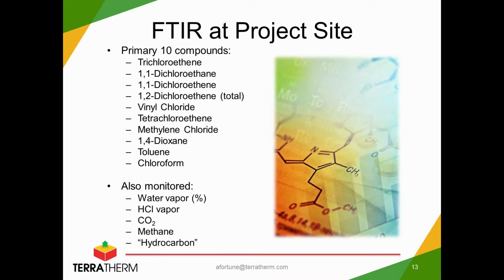I will note that a few of these components that are especially water soluble, so the hydrochloric acid vapor and 1,4-dioxane, we weren't expecting to see a huge amount of those get through to the FTIR because of that multi-point sampler conditioning system, where we're knocking out a whole bunch of that water vapor. But this was a pilot installation for this instrument. The first time we were using it, we just wanted to challenge it and see if we could see these components in the stream.